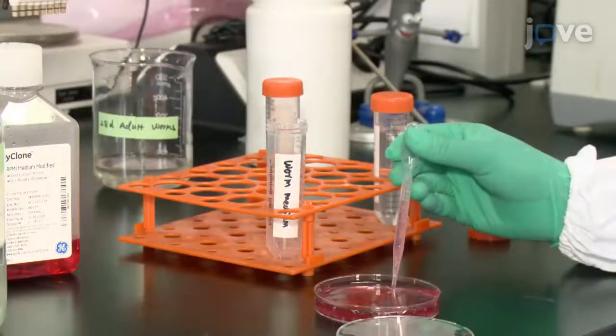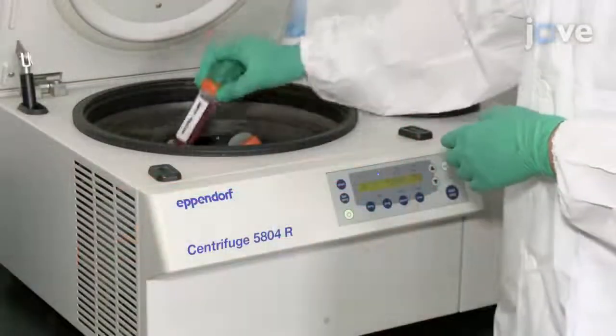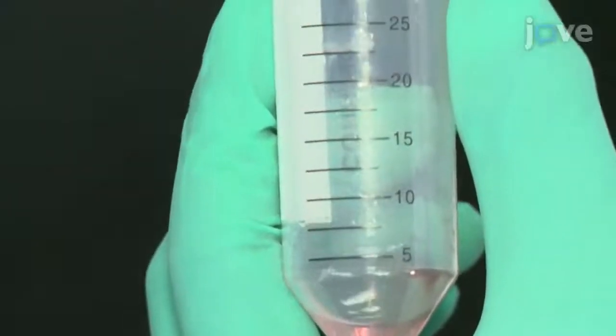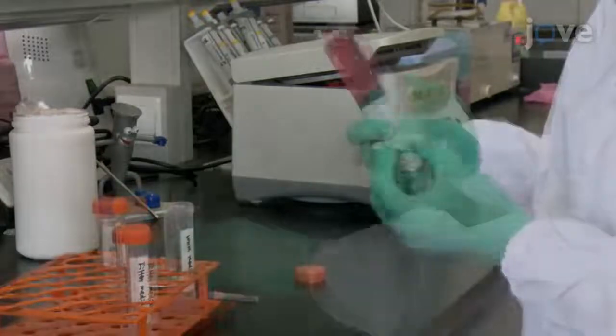After two hours, transfer the media from the plates to centrifuge tubes, and then pellet the eggs and worm debris at 2000 g for 30 minutes at 4 degrees Celsius. Then collect and transfer the supernatant to a fresh tube. Next, filter the supernatant through a 0.22 micron syringe filter.